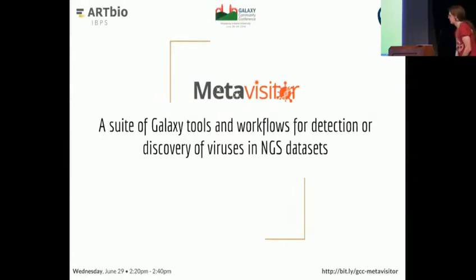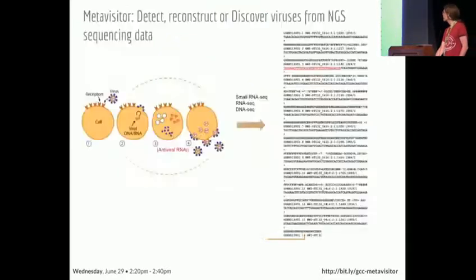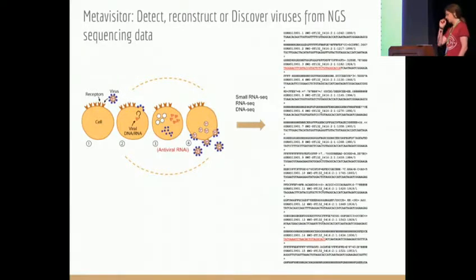So this is about the Metavisitor, which we had been working on in the lab for, I think, two years now, more or less. This is a suite of tools and workflows for both detection and discovery of viruses from NGS datasets. So a super small introduction to viruses.